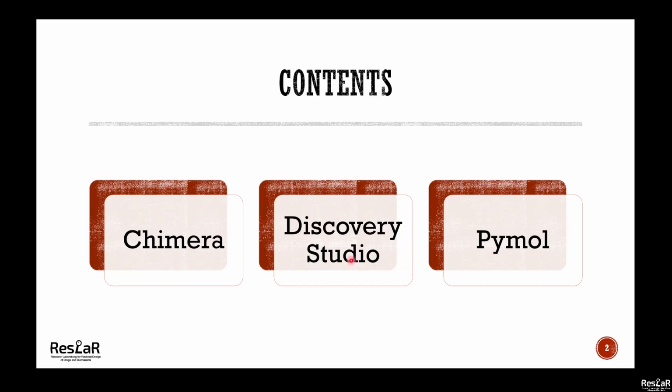We're going to deal with three tools, the popular Chimera, Discovery Studio, and PyMOL, on how to use these tools to visualize your structures, ligands, and especially macromolecules, proteins, DNA, whatever. It's also very important when you want to produce publication quality images. Believe me, I've used a lot of them and it has really been great and wonderful. Understanding how to use them is a skill you wouldn't want to miss out on.